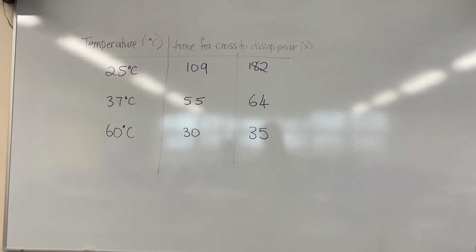So we could make sure we've got the same person and make sure that we're fairly clear about the end point. You could also use a colorimeter or a ray of light and a light sensor, which would determine an exact number, and when you reach that number you would push stop on your timer, because it tells you how cloudy or clear the solution is. Okay, so that's it for this experiment. Hopefully it was useful, and I will do a second one for when we do our concentration and rate of reaction.